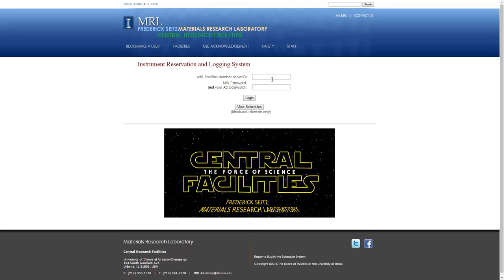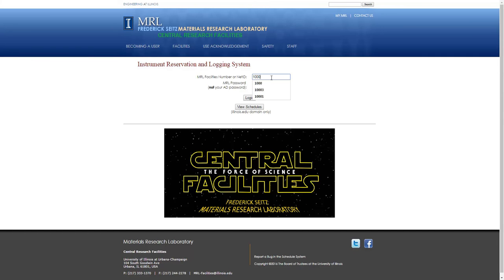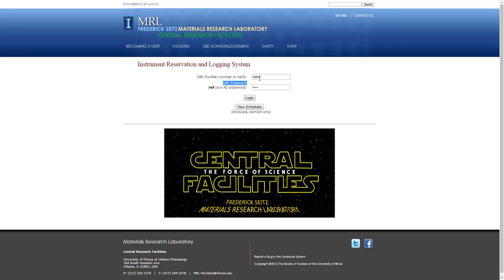To log in, use either your MRL user number, which is a 4-digit or 5-digit number, or you can use your NetID. Please note that your password here is your MRL password, not your email password if you're doing your NetID. And then click Log In.